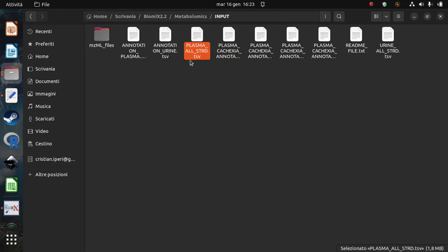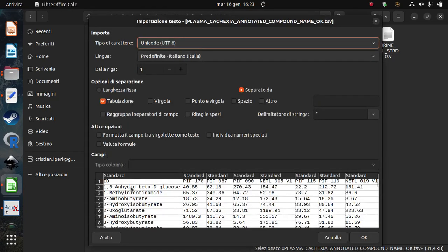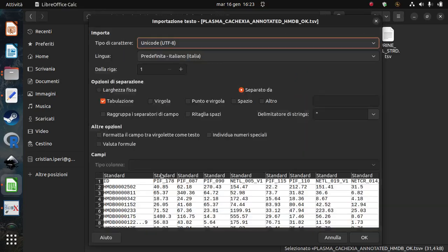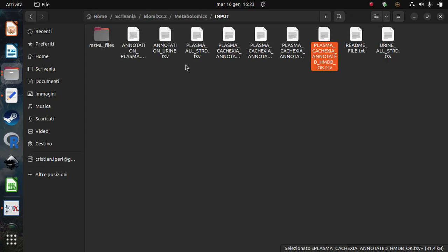If you remember from other datasets, like the one that we used last time, here we have names. We can also use in BiomiX datasets including this one, having the human metabolome number that corresponds exactly to a specific metabolite. But when we have just peaks, we need to find the annotation for this specific peak, and that's why we do an MS1 or MS2 annotation.